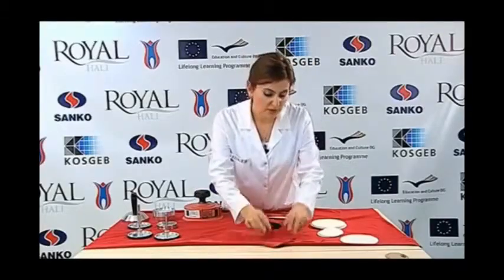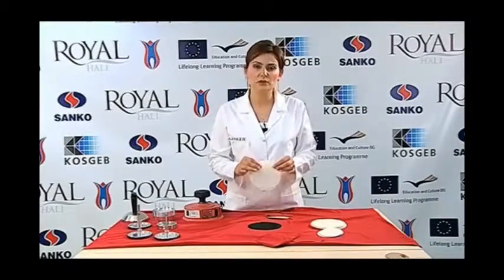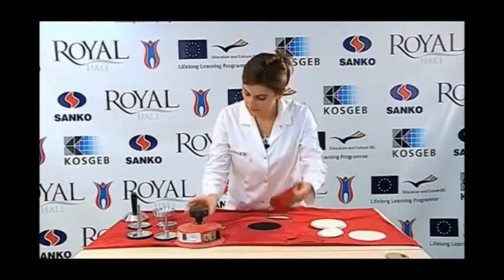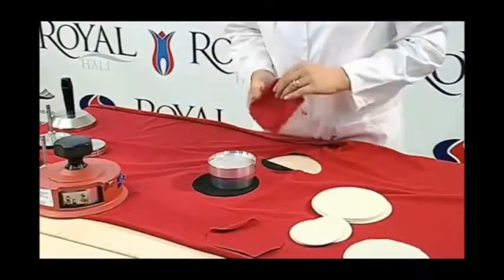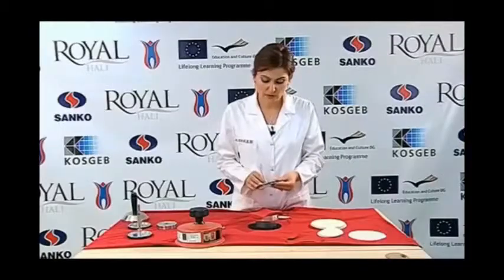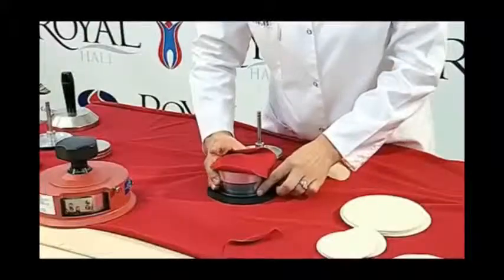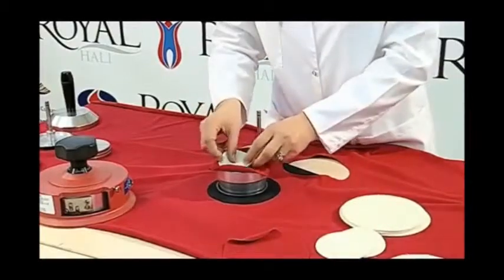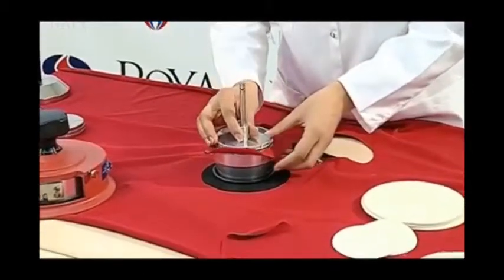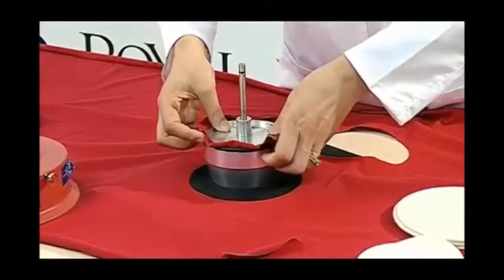We use standard felt as abrasive cloth for upholstery fabrics. The diameter of the felt fabric is 140 mm. We place the sample we cut so that the front side of the sample faces downwards in the positioning apparatus. Placing the rubber collar of the sample holder below, we place the 90 mm diameter felt on top of the sample.